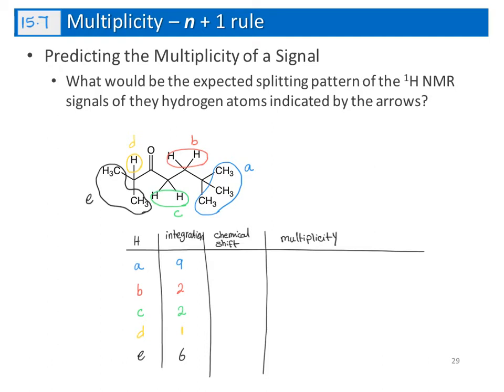And alkane, we expect to see them 0.9 to 1.7 ppm. Now for the red hydrogens right here, they are connected to this carbon. That carbon is connected again to 2 carbons. So again, these 2 are alkane hydrogens. So same thing, we expect to see them 0.9 to 1.7 ppm.